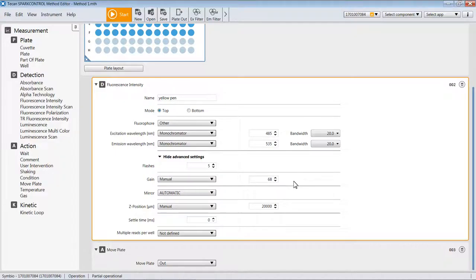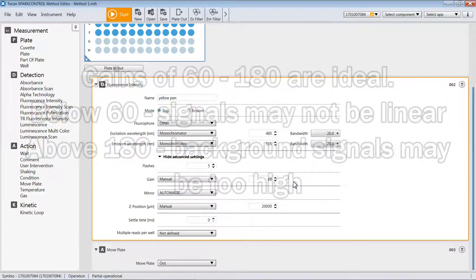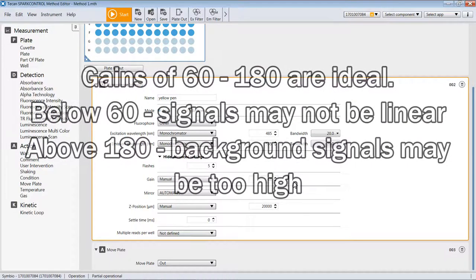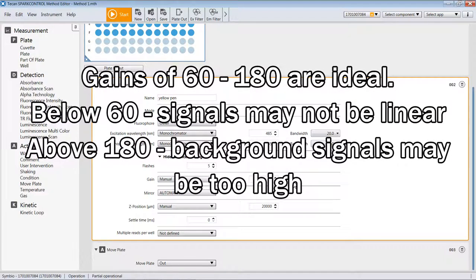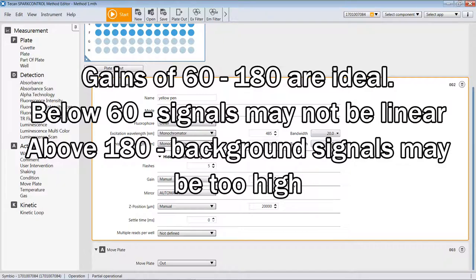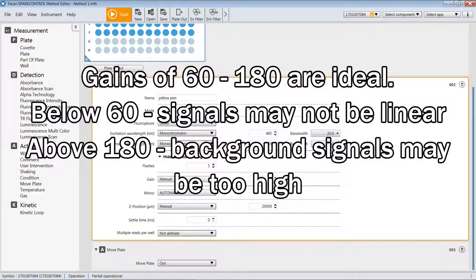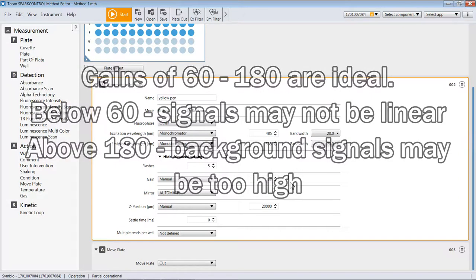Be mindful that ideal gains for instruments like the Spark will range between about 60 and 180. For very bright samples, the instrument may try to use a very low gain, something under 60, or for samples that are very dim, and maybe there is no fluorescence, it may come back and give you a gain that's much beyond 180. The instrument can, at very high gains, produce what appears to be signal when, in fact, it's just amplification of noise. It's best to try to operate within a range of about 60 to 180 if you can.